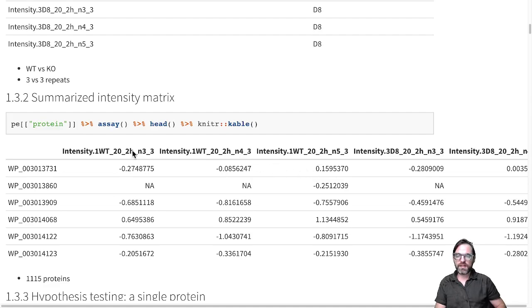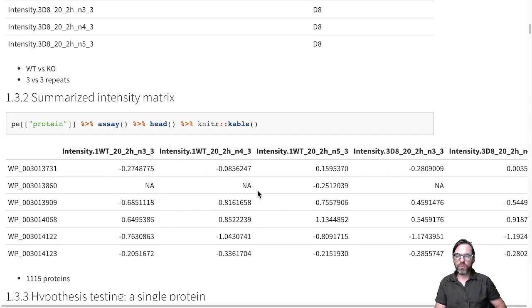And we see that we tend to have some missing values. So the NAs are missing values indicating that we have no quantification for these proteins in this sample.